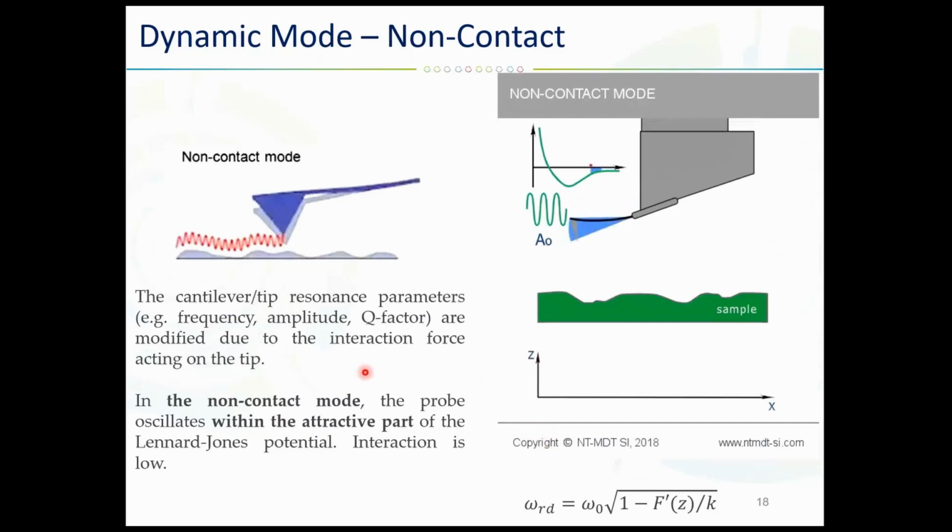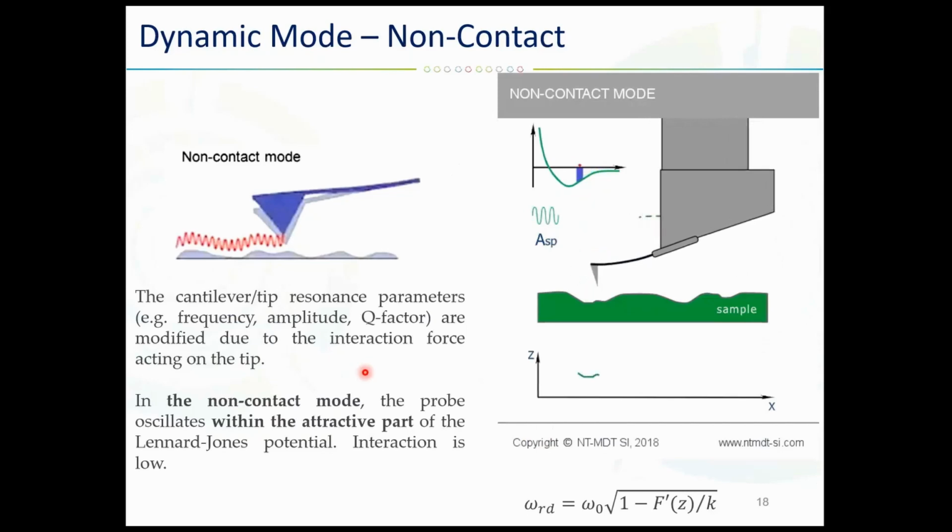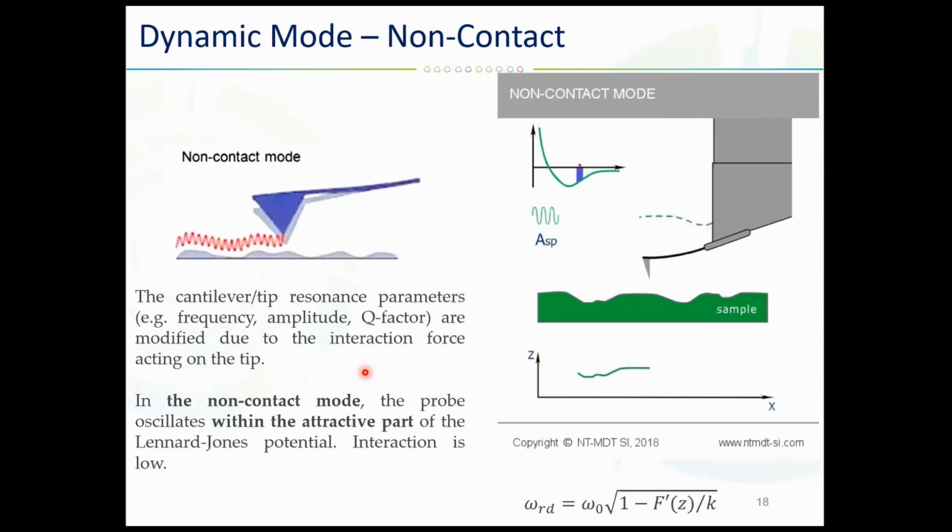Here what we do is change the amplitude A of the oscillating cantilever while it is interacting with the sample.